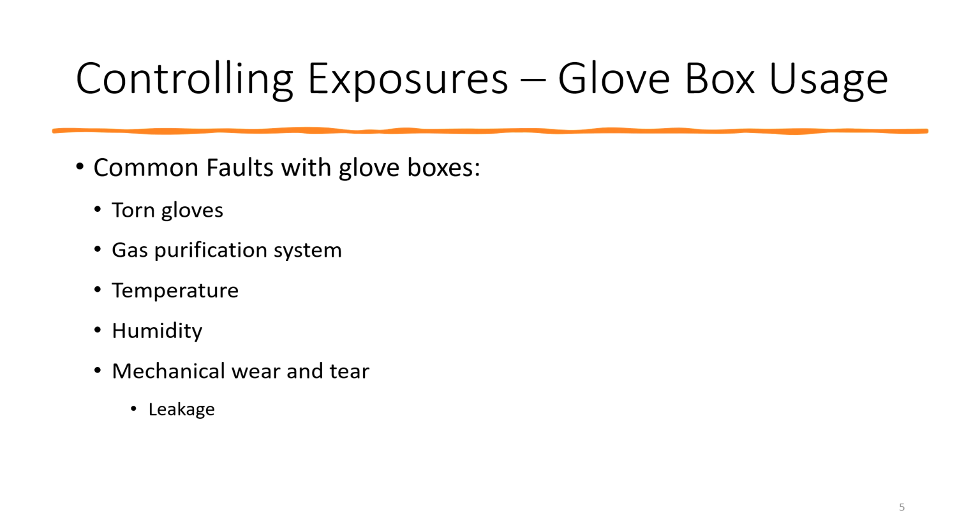Temperature and humidity. This is what's happening in your lab. Sometimes your lab is out of control with temperature and humidity. So it's up to the user to go back and say, I am now operating within whatever the spec is. The spec could be something like 69 degrees plus or minus 2, and humidity is 40 to 50%, because that will mimic the process that you have, so that you can say, I have 100% controlled it, just as when I make something it is going to be controlled.